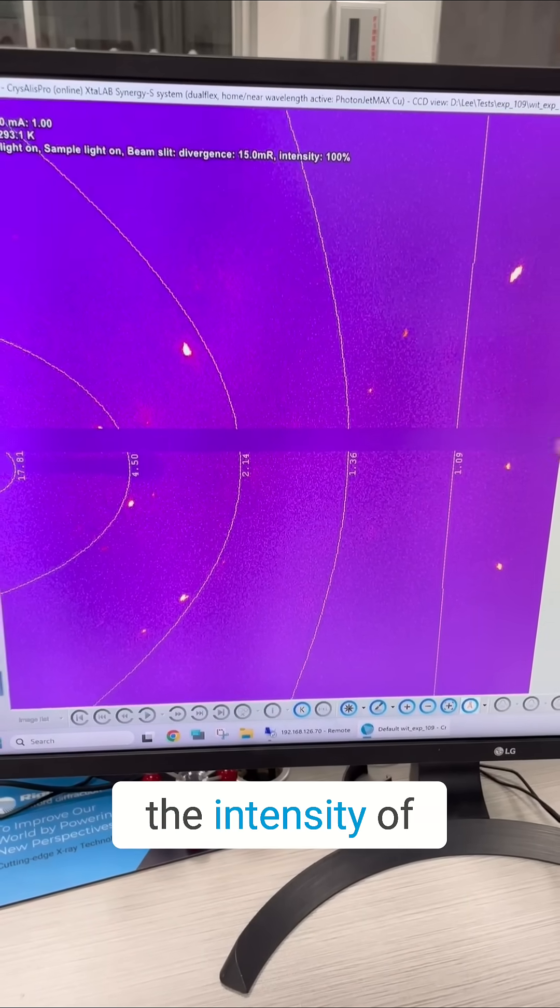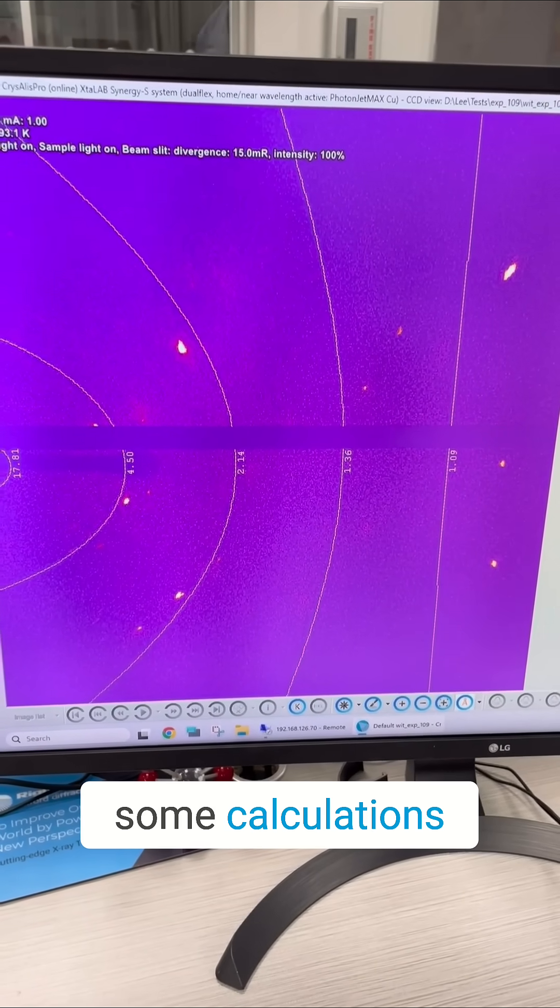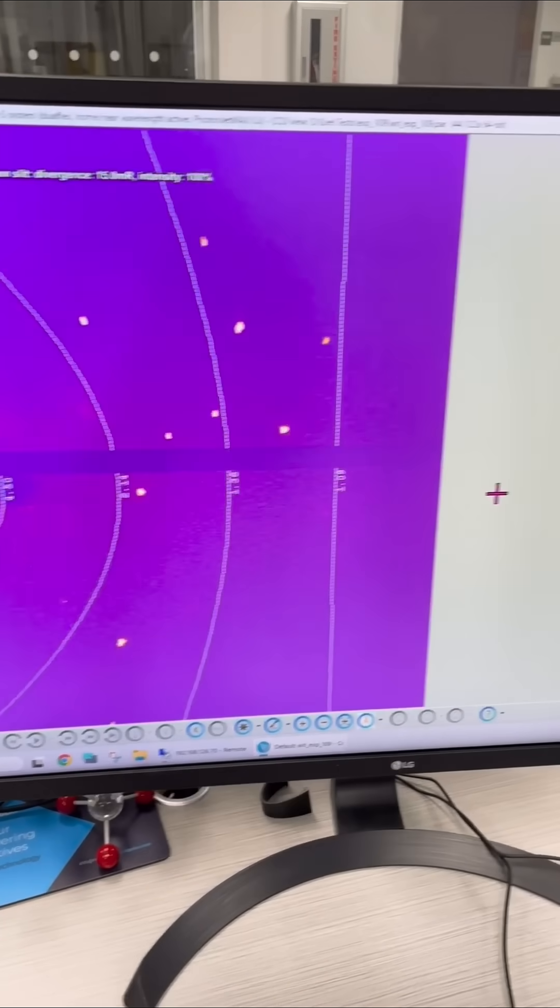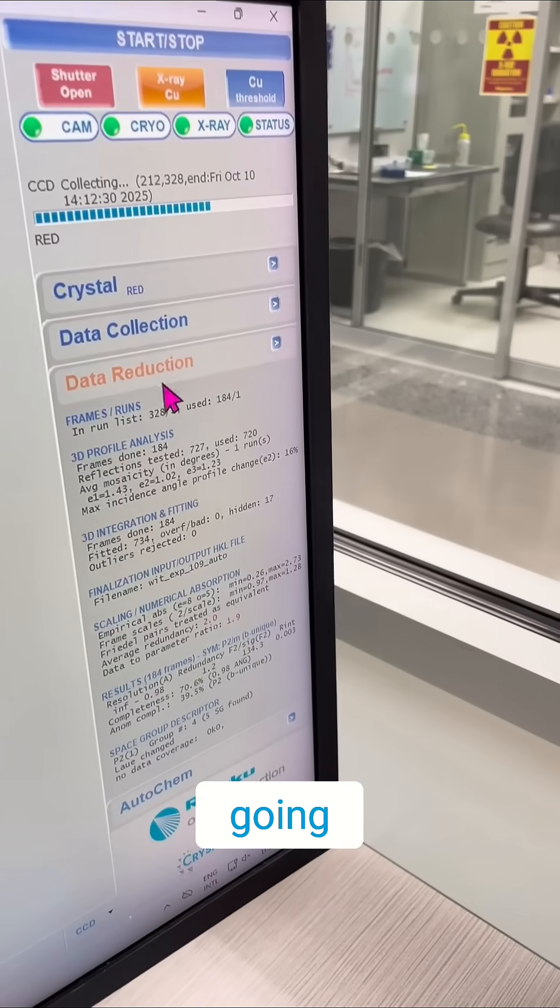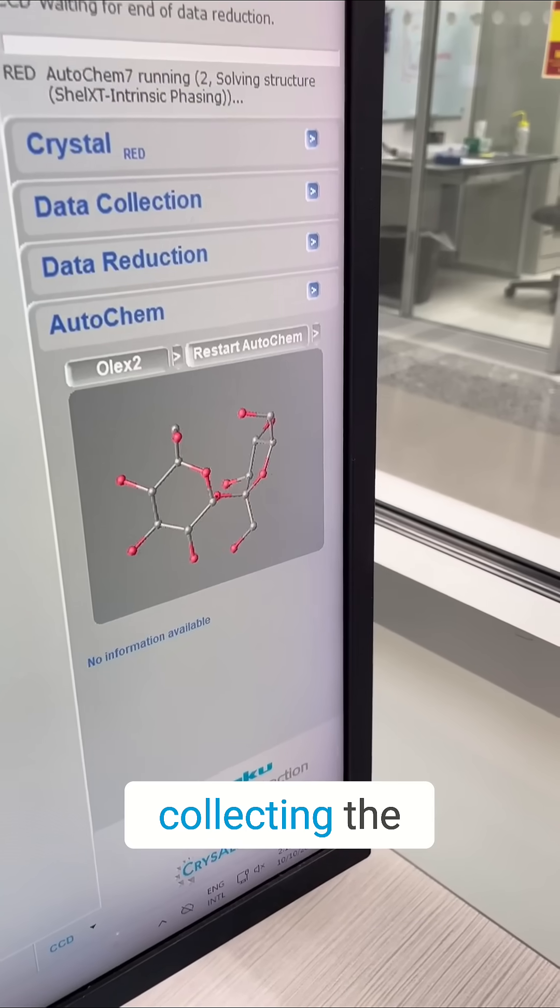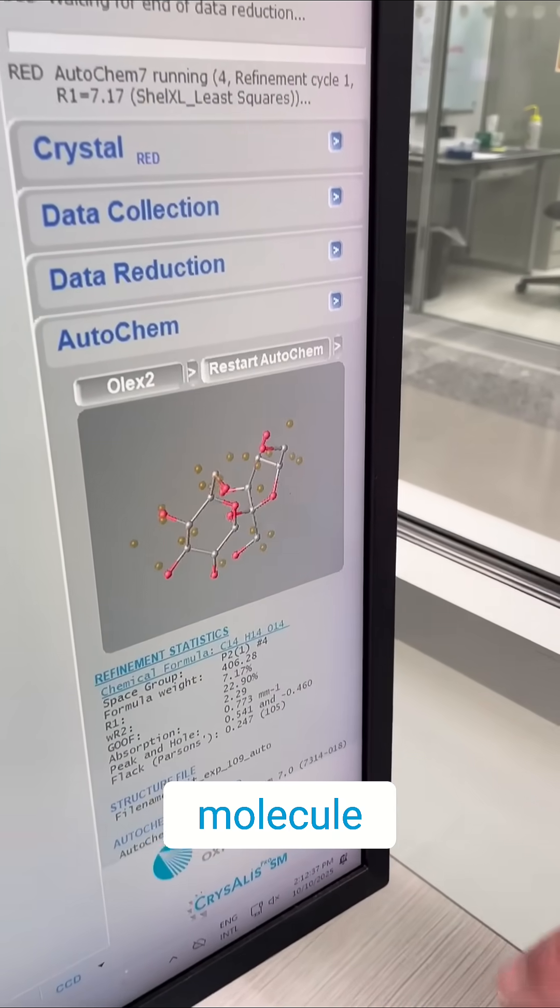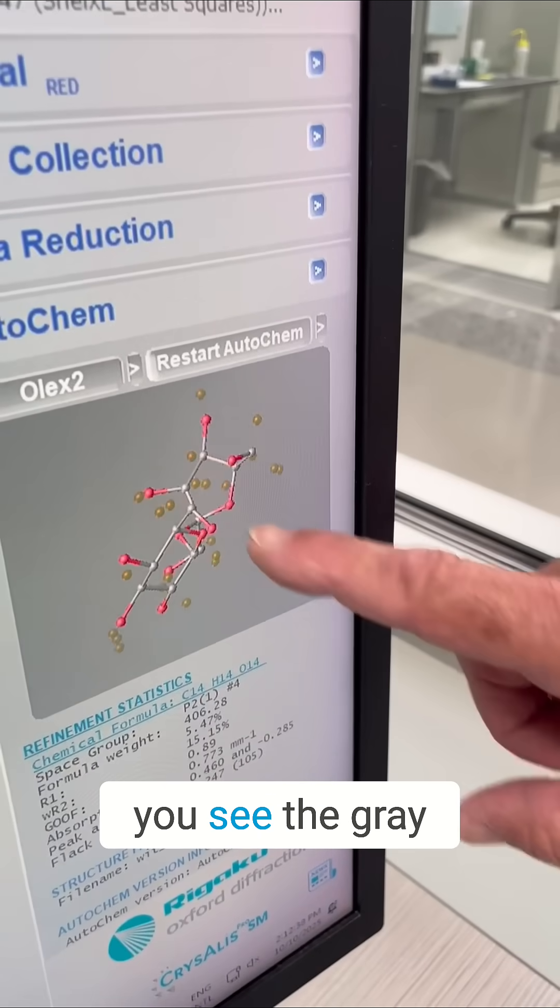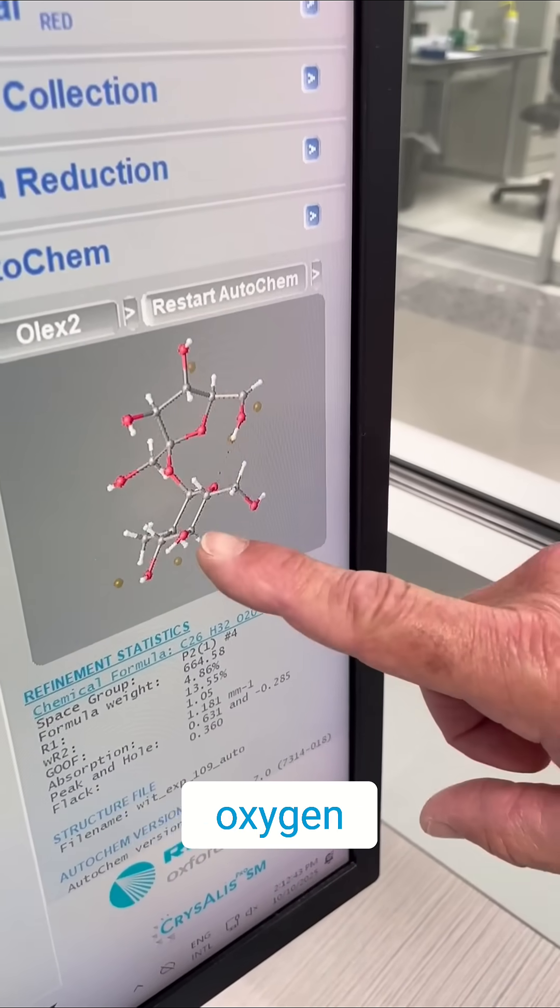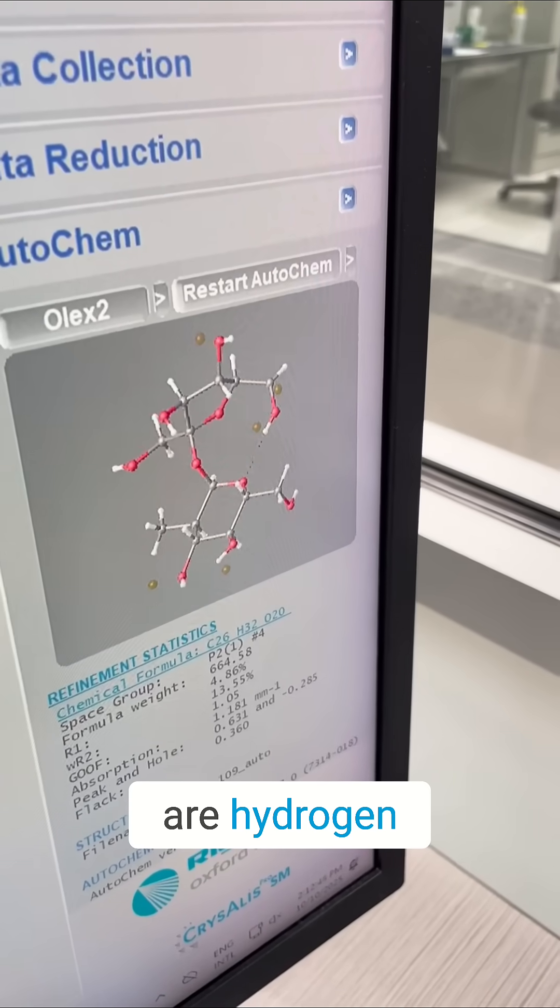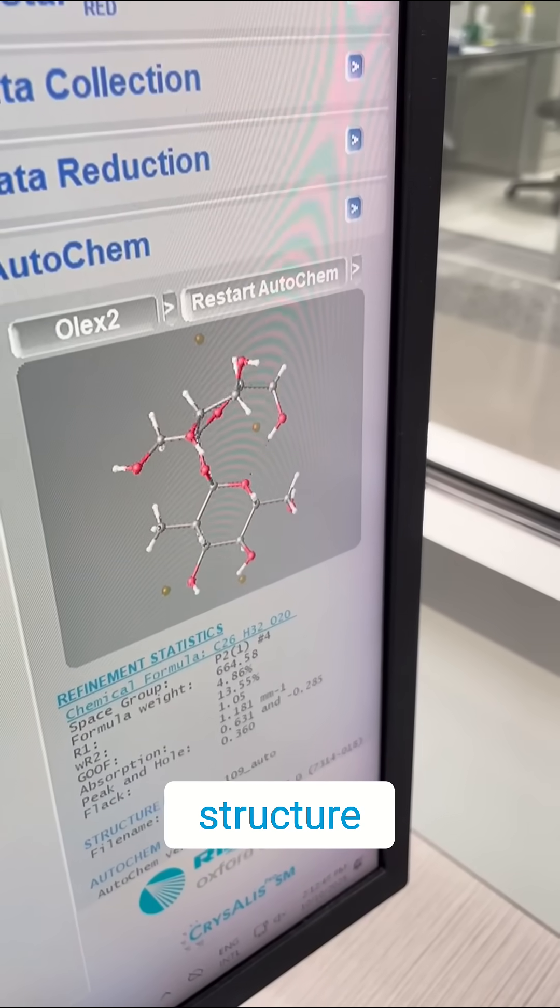And so we measure the intensity of those and then we do some calculations. And if we look over here, we see that there's a data reduction going on. It's done collecting the data. And now a molecule has popped up and you see the gray ones are carbon, the red ones are oxygen, the white ones are hydrogen. And that's the structure of sugar.